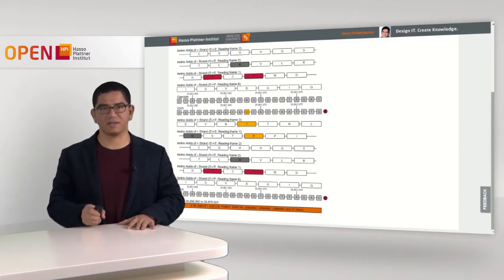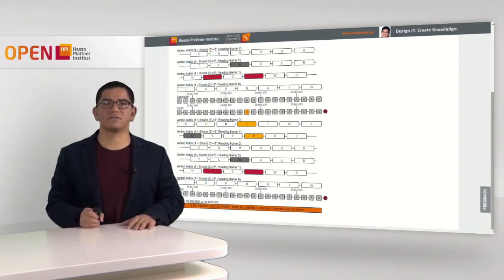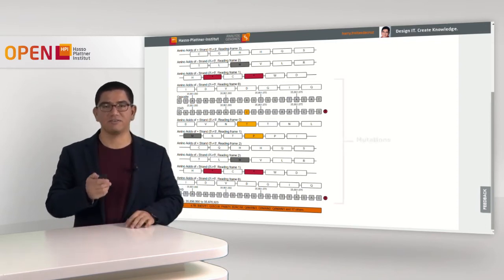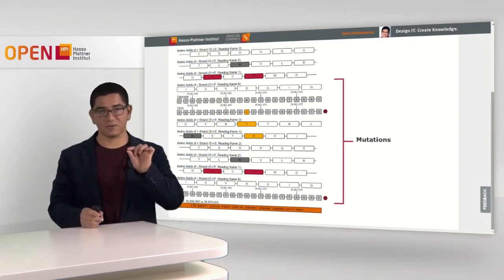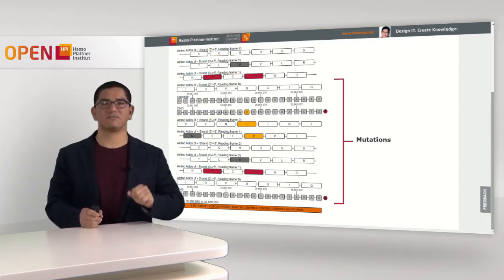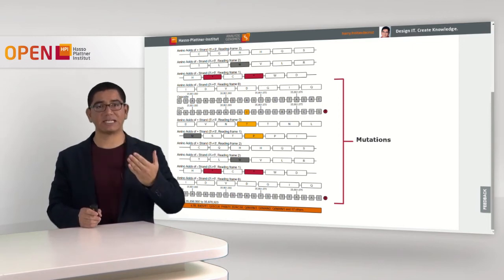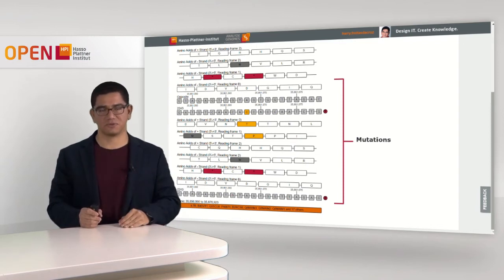You see the specific position, for example, which is colored yellow, and that's a position where the gene is different from the reference. If you see, all of these mutations are also displayed. For example, this single mutation in that position caused the amino acids to be different as well. So you can easily see and directly see the different reading frames where mutations occurred.